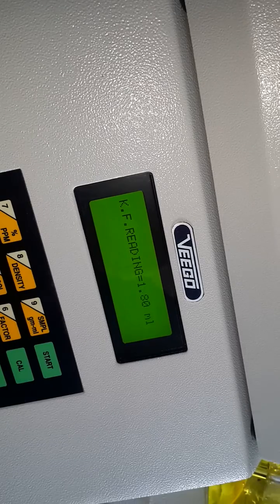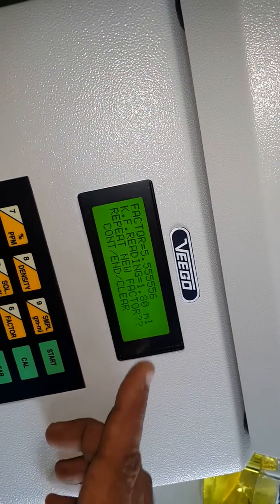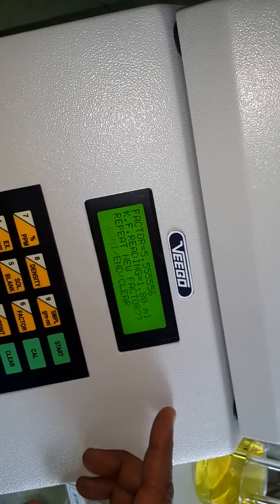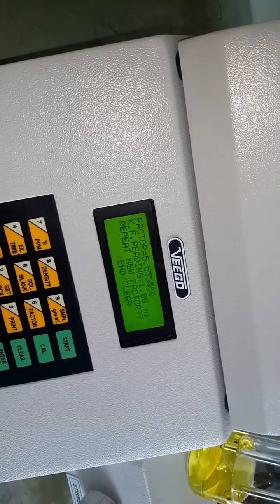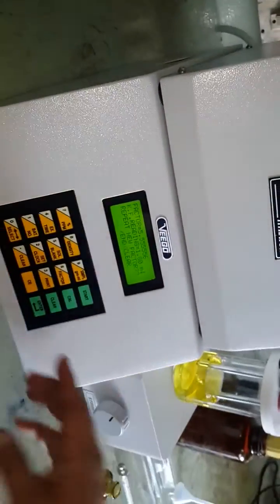The reading is 1.8 ml. So 1.8 ml of Carl Fischer reagent reacts with 10 mg of water, meaning 1 ml corresponds to 5.55 mg of water — that is 10 divided by 1.8. You can repeat the titration like this.